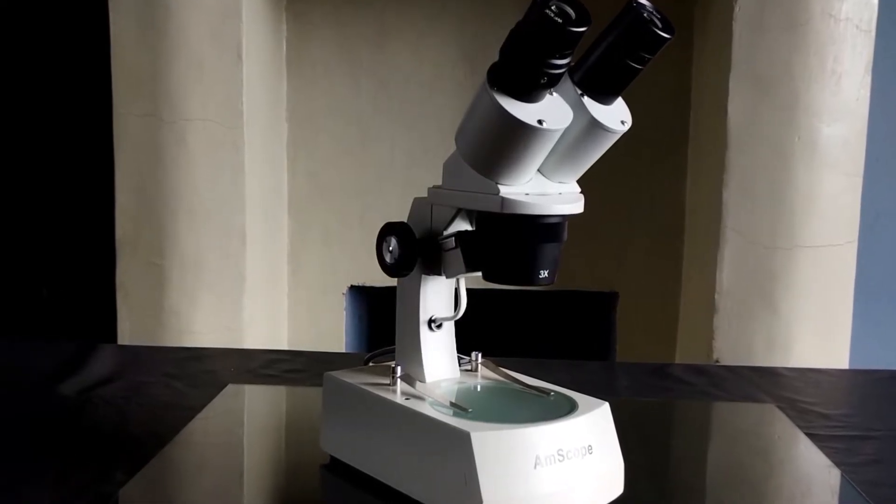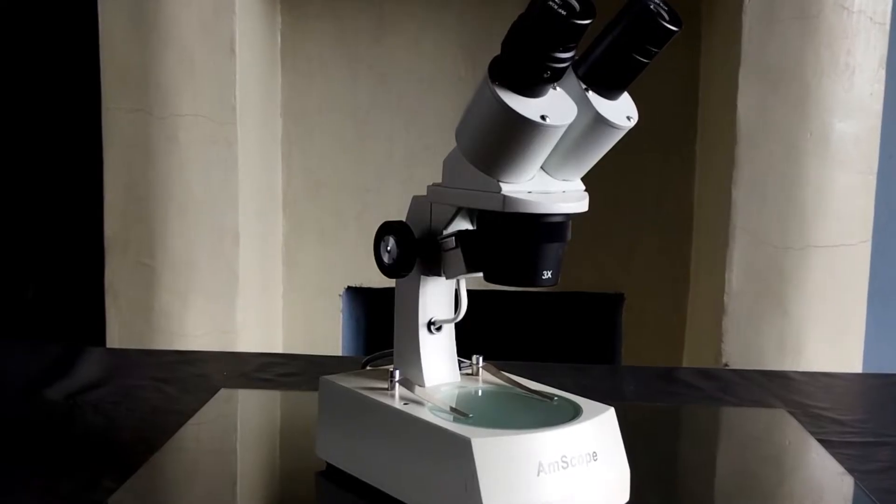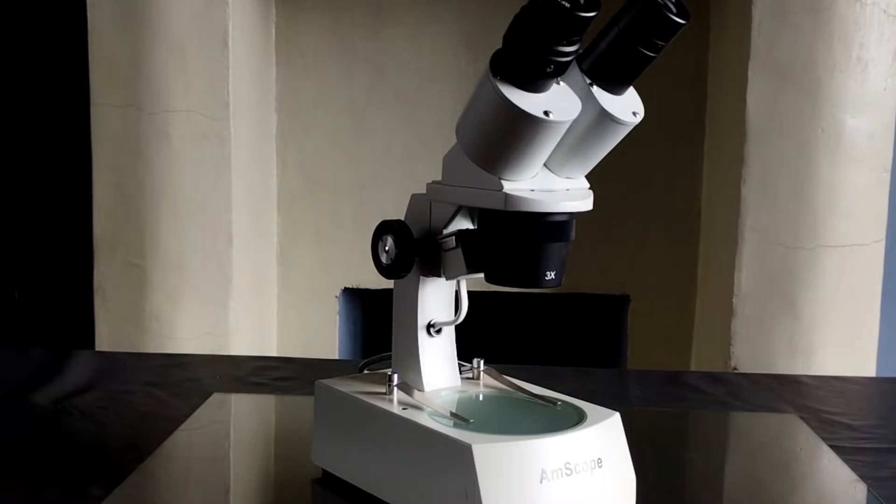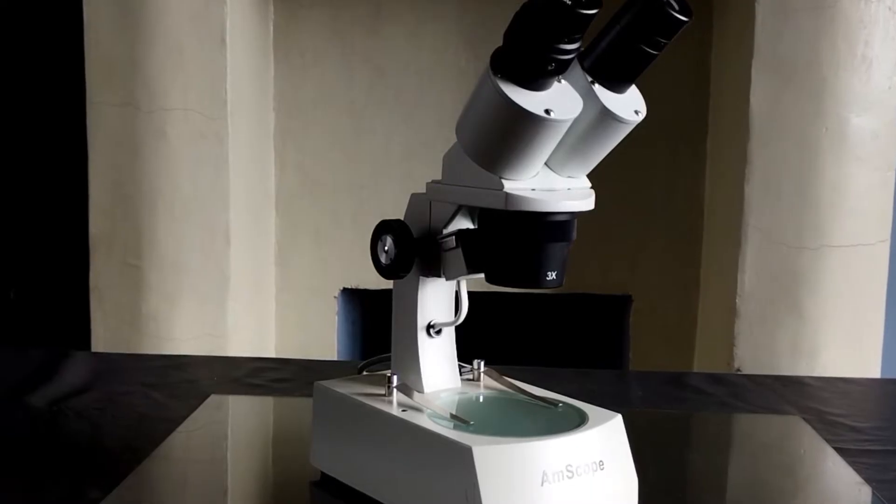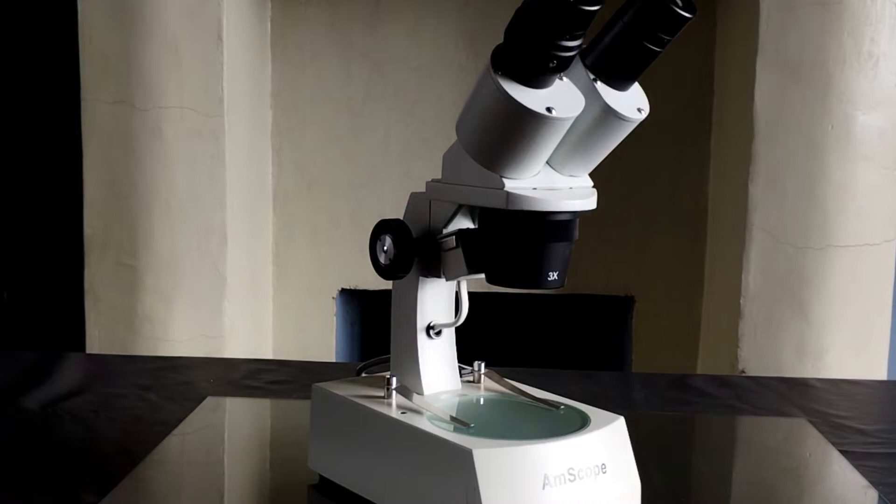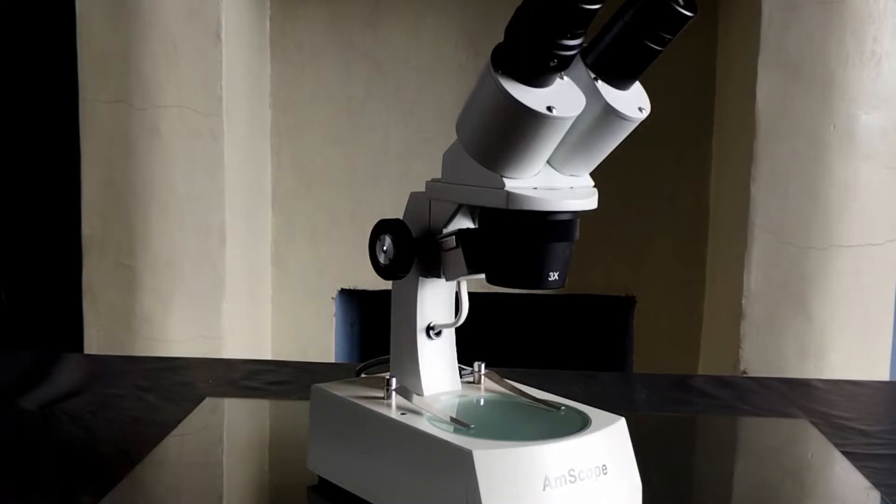The Stereo Microscope is widely used for surface examination and study of organisms, electronic components, rocks and minerals, etc. It is also commonly used to assist in the dissection of minute parts of organisms that do not require extremely high magnification but are at the same time too small to be done with the unaided eyes.